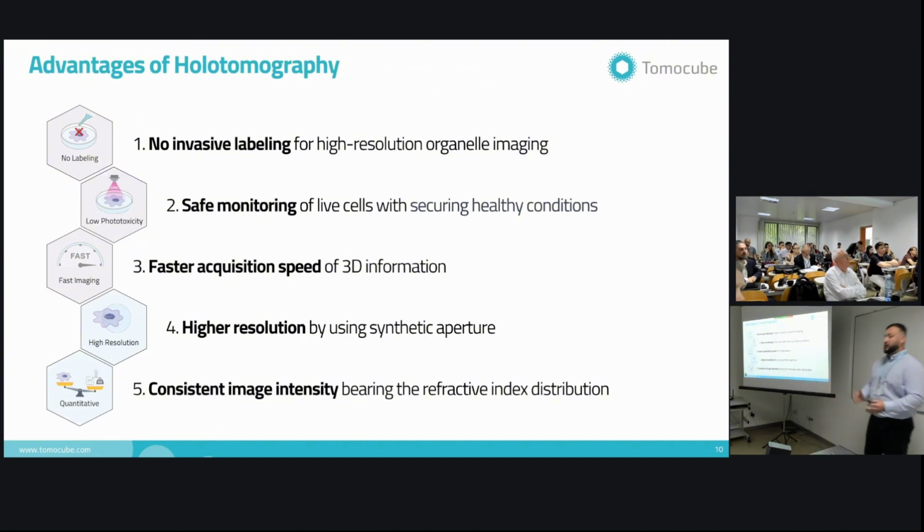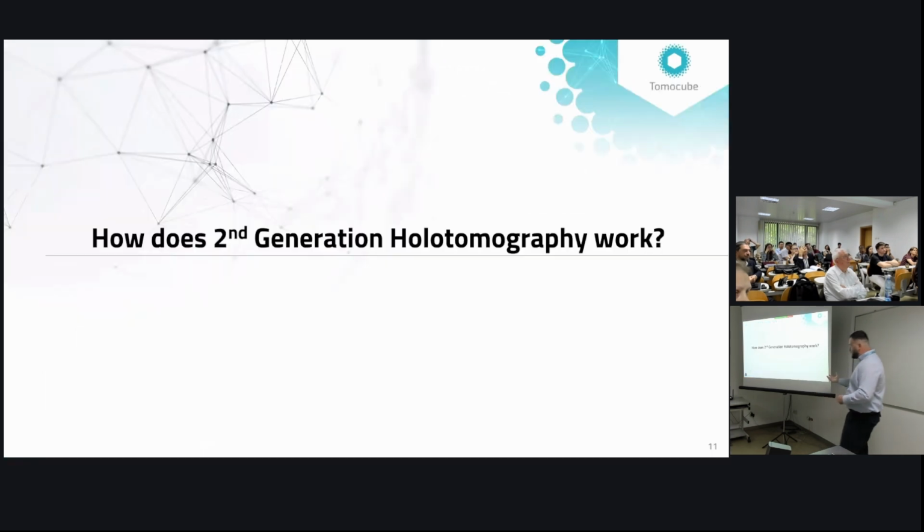That means it's not dependent on how long the fluorophore is inside the cell. Do we have any photobleaching? We're constantly imaging with the same method across. So if something changes in the cell, you're going to see that change. And that was the example that I gave you at the beginning, where you see the cell literally being killed, or being signaled to kill itself, by the T cell. And you see the changes without having to label anything.